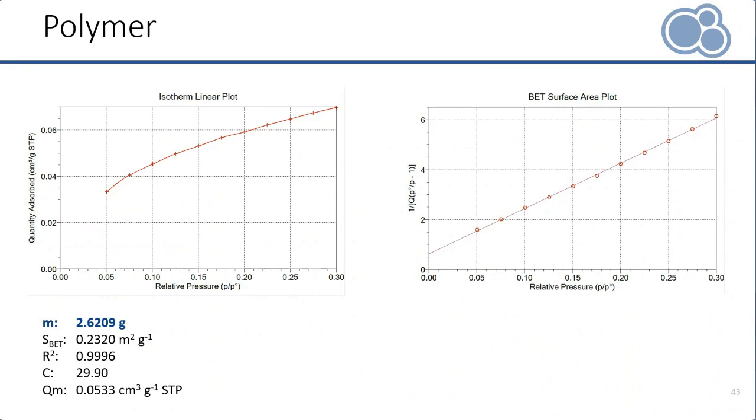In the static manometric method, the volume that is adsorbed is calculated using the measured pressure differences. If we have only small absolute surface in our sample tube due to low sample mass and small specific surfaces, the pressure difference that occurs after adsorption is very small. In this case, a higher measurement accuracy can be achieved by using larger sample quantities.